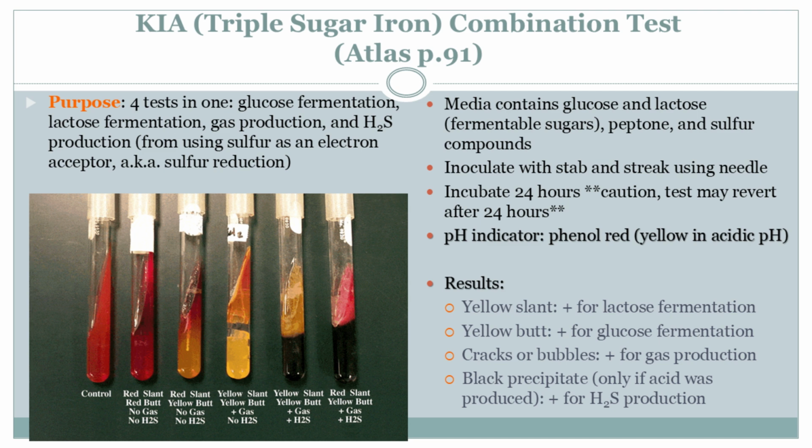Okay, so we've got our colors, our gas production. Anything else we should be on the lookout for in this microbial investigation? Just one more thing. That black precipitate we talked about earlier. Now, don't be alarmed when you see it. It's not necessarily a bad thing. It just means our bacteria have produced hydrogen sulfide while breaking down certain compounds in the agar. Remember the ferric sulfate? It's reacting with that hydrogen sulfide, creating that black iron sulfide we're seeing. So it's like a little chemical reaction sideshow. Exactly.